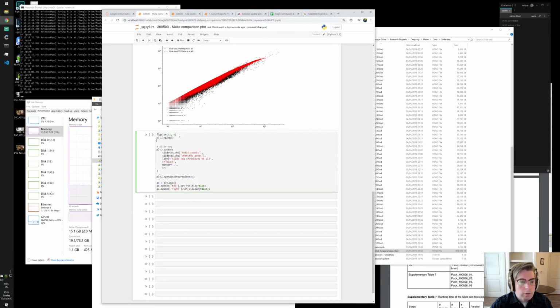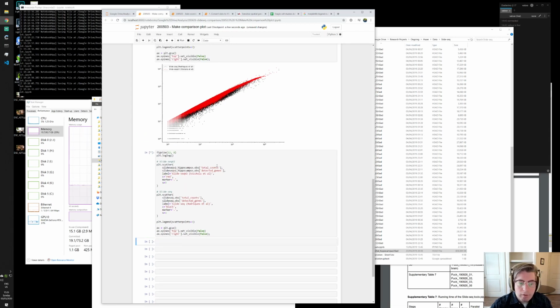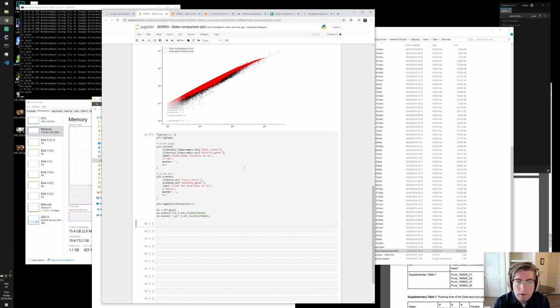So now it will plot points from Slide-seqV2 below the Slide-seq1 points. And then we can see if we can see the Slide-seqV2 data peeking out. But I don't think so, because I think the upper limit here is just like a theoretical upper, or it's based on just sampling theory from a multinomial.